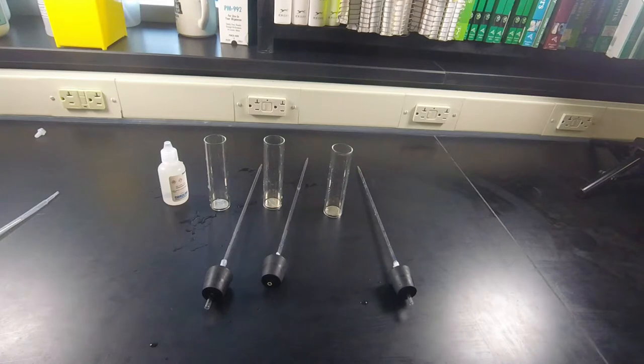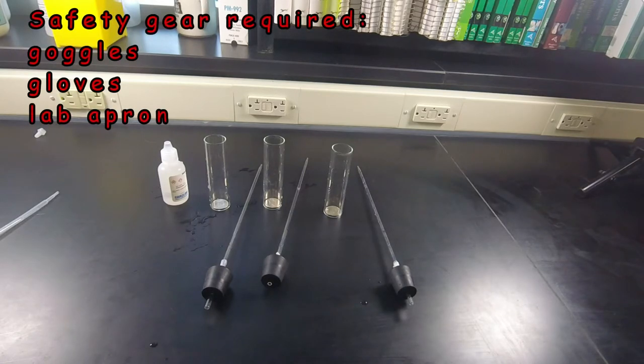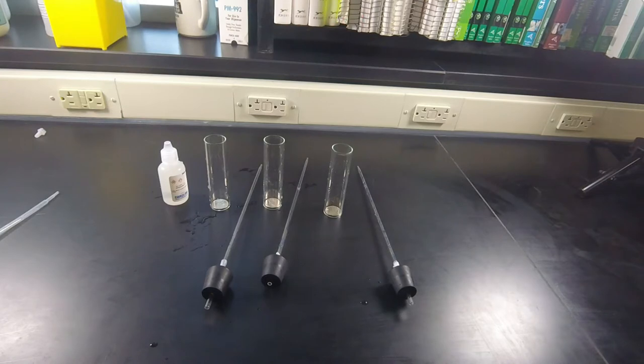For all of the next steps in this activity, it is essential that you are wearing the proper safety gear. So you must be wearing your gloves, your goggles, and your apron. Please pause here and go and gather the safety equipment if you have not done so already.